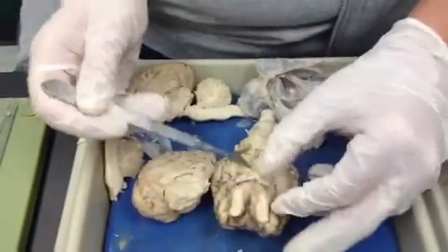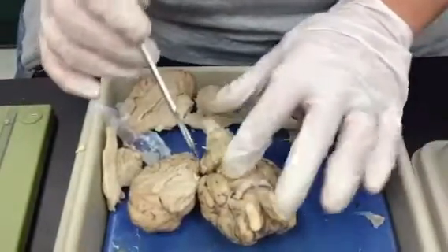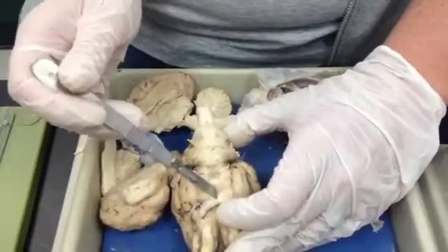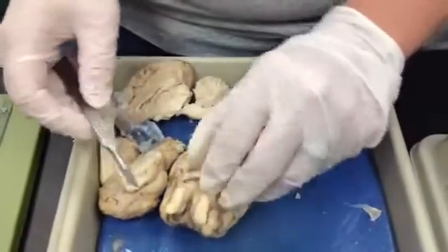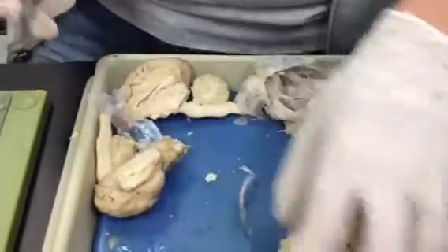So this is the optic chiasma, this cross right here. I'm going to get off the rest of that meninges, but I don't want to risk ruining my little baby that I spent so much time on. So again, the tracts, the optic chiasma, and then these are the optic nerves, right? Which cranial nerve is that? Cranial nerve number what, for the optic? Optic is 2, right. Cranial nerve 2, optic. Okay, I'll work on that later.